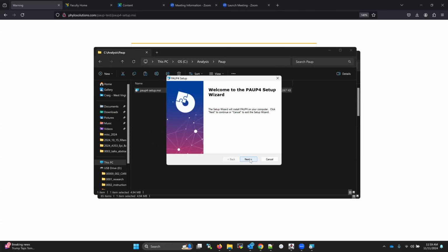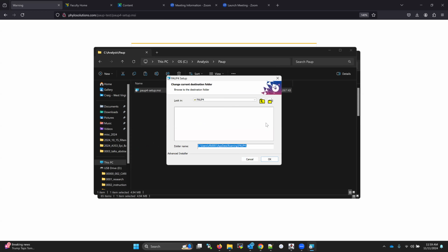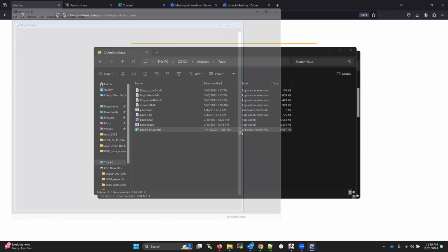Should run the installer. I'm going to change this destination to... So you can install this anywhere you want. Okay. Next, install, finish. Okay, didn't want to do that.